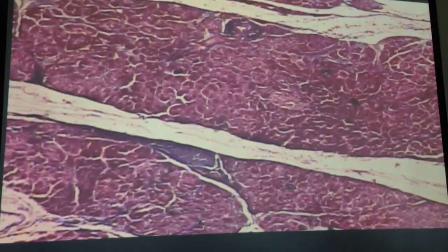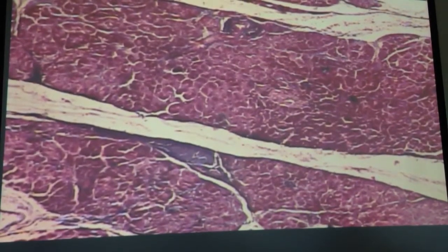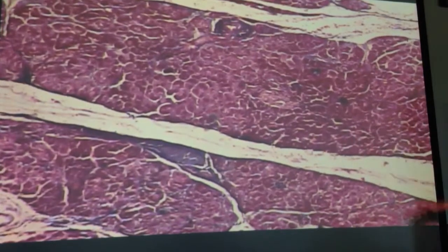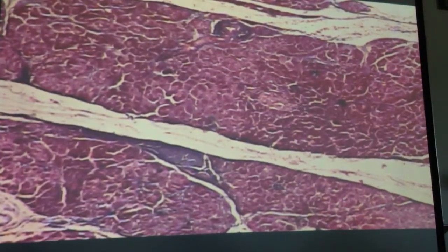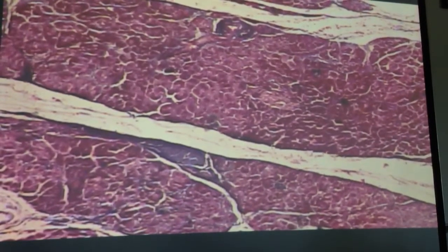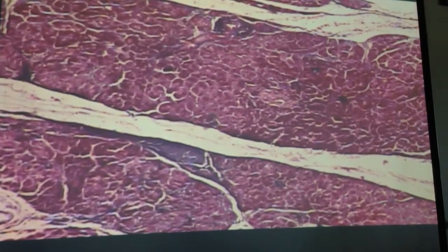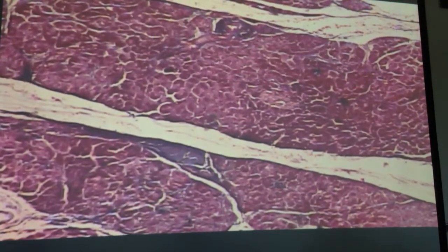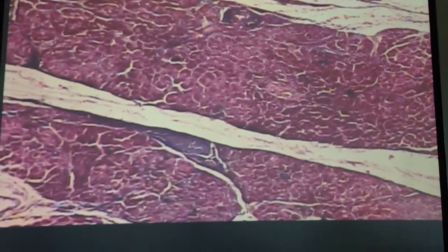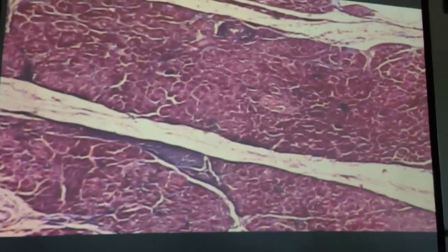So with this one, the only thing you'll need to know is serous acini, which is just everything but islets of Langerhans. So basically, if you were to point to anything but the islets of Langerhans, it would be serous acini. That's all you need to know for this one, that it's the pancreas and the serous acini. And again, since we have some time today, I definitely recommend calling out all three of these glandular tissues and making sure that you're comfortable telling them apart, because they do look similar enough that you could easily confuse them on the practicum. All right, next we'll do the lung.